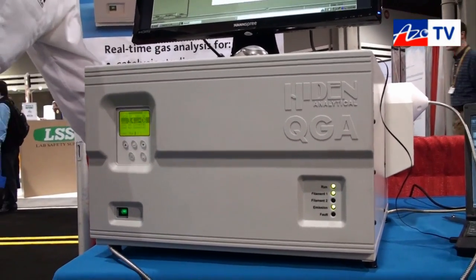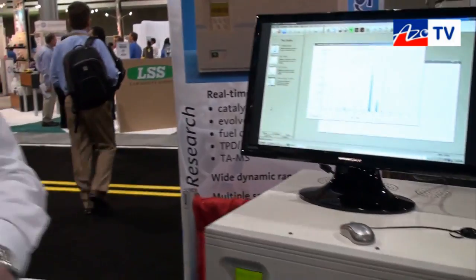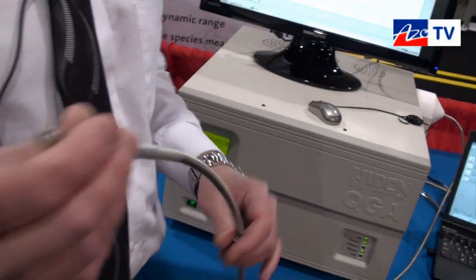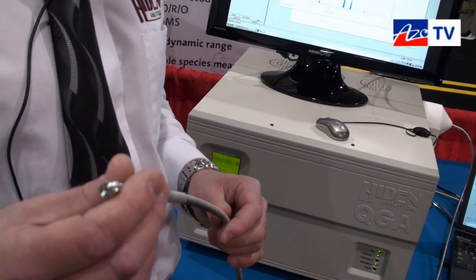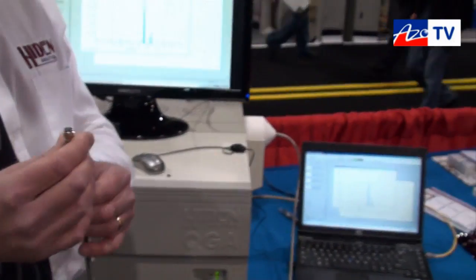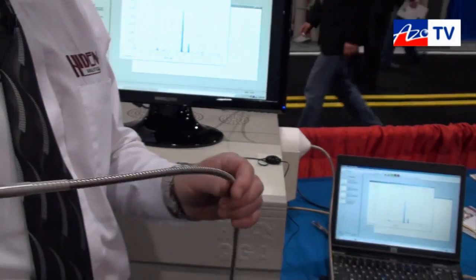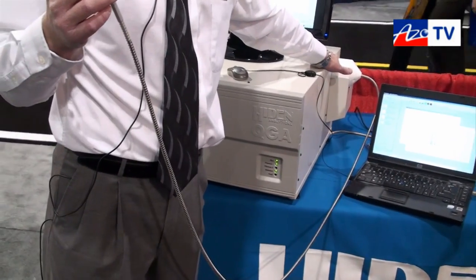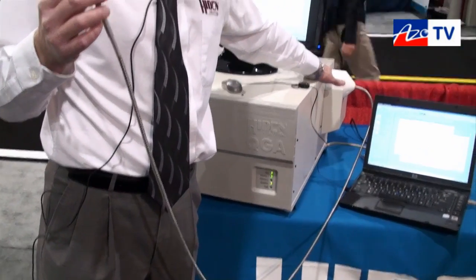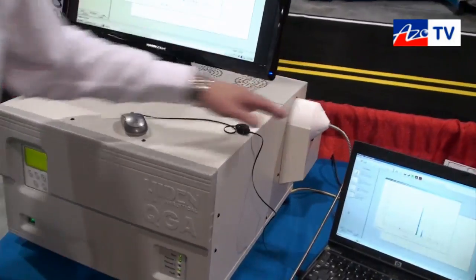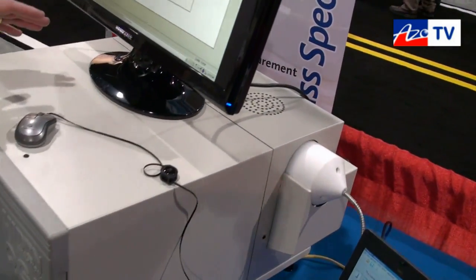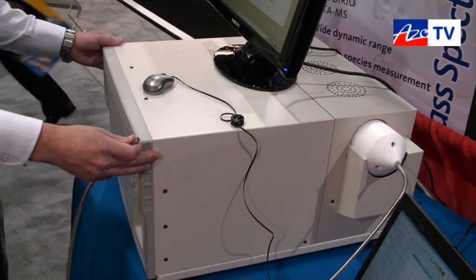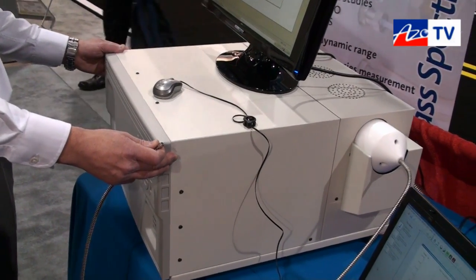This particular system uses a 2-metre heated flexible capillary to draw gases from the experiment. Those gases flow down a heated capillary liner and are injected directly into our quadrupole mass spectrometer, which is neatly packaged into this compact atmospheric pressure gas sampling system.